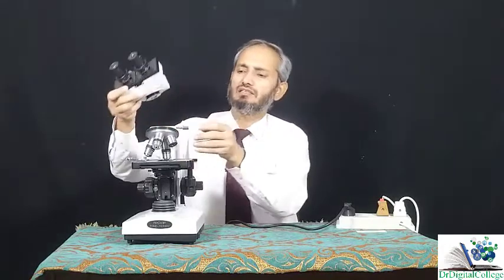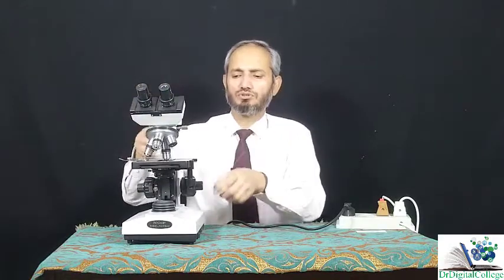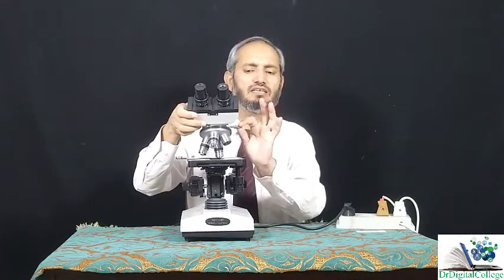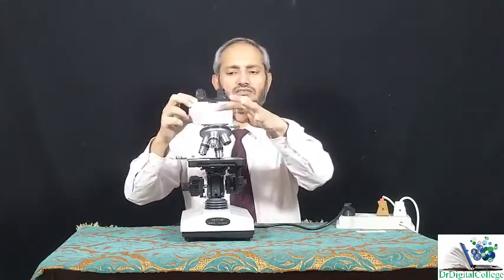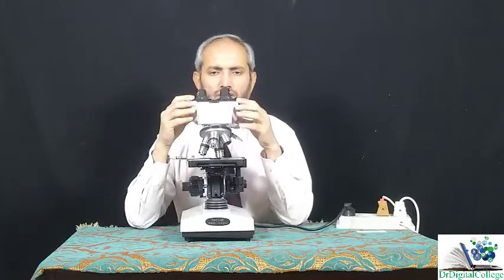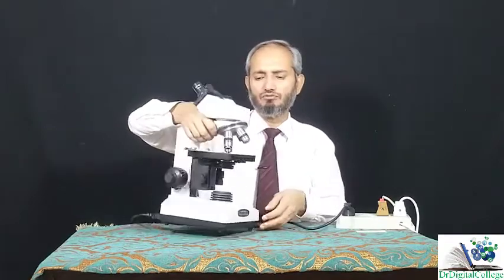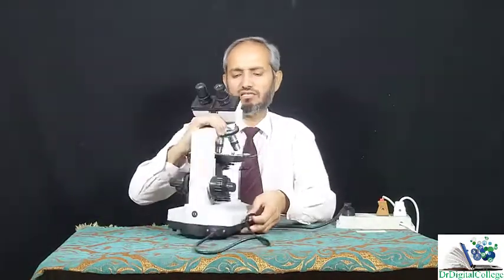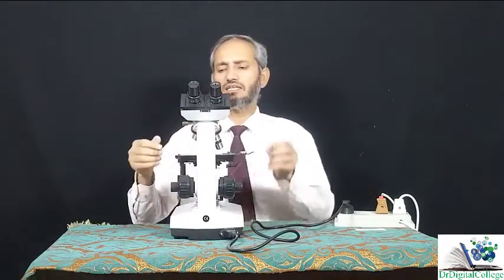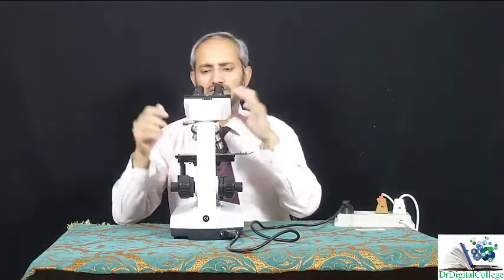This is fixed over here. What you are supposed to do is put it here and unscrew it lightly like this, and you can twist it like this, holding it very gently, so you can move it towards your eyes. Or if you have been given the microscope in this form and you want to use it in this direction, say, if you want to observe your object in this direction, you can change your eyepiece like this. So this is the way.